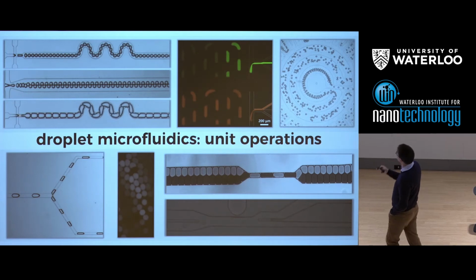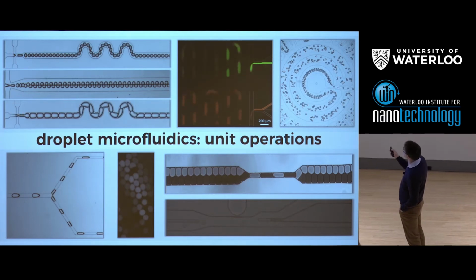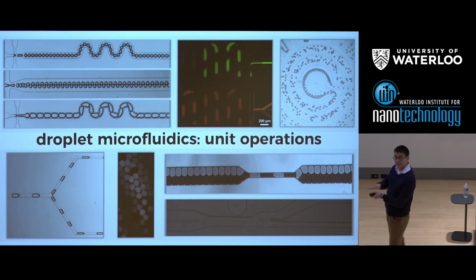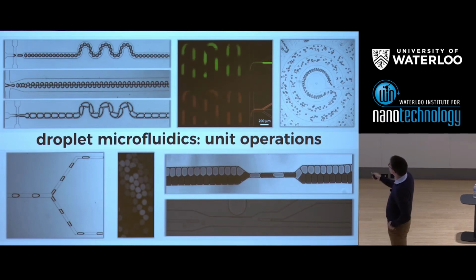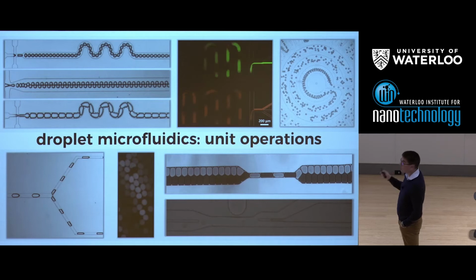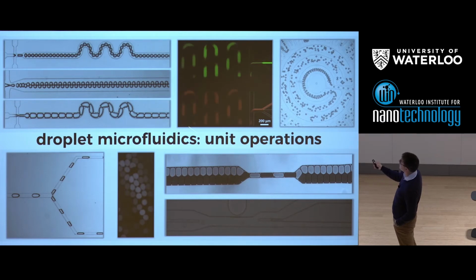Now secondly, as you can see in this middle one, again we're making droplets. What we're doing in this case is we're making droplets at a T-junction. I'm then splitting the detector channel into a red and green channel, because what I'm doing here is delivering a red fluorophore into our droplet through this laminar stream and a green fluorophore through this laminar stream. If you look at the red laminar stream, you can see that's got a constant width. We're keeping the flow rate constant, and that's why the droplets look uniformly red.